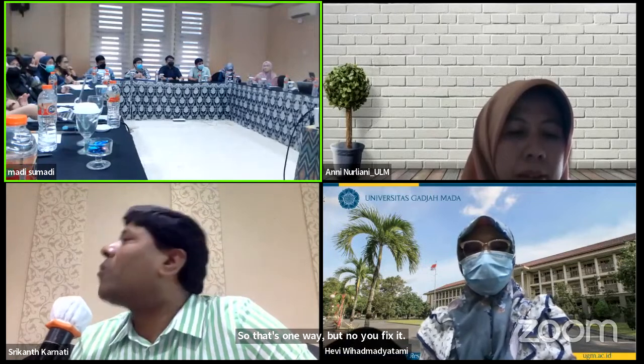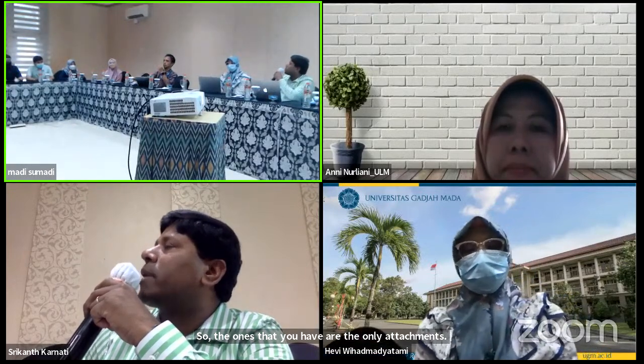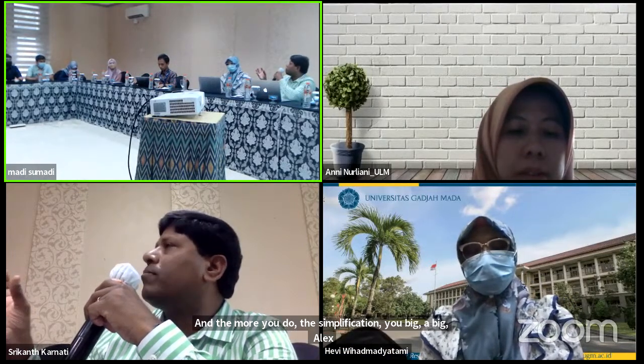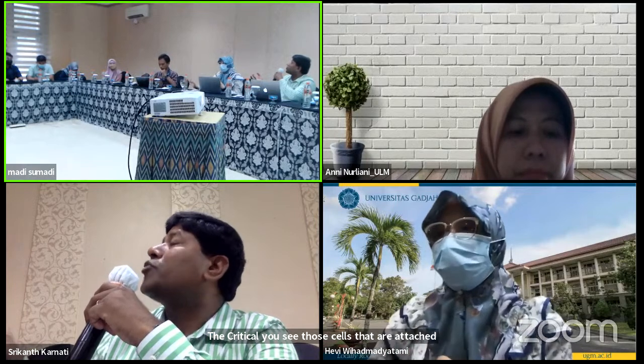Thank you. I think what you said is absolutely true. When the cells die, they won't attach. But you fix everything, whether the cells are dead or not. And before that, you need to do centrifugation, right? When you do the centrifugation, the dead cells are already gone. So the ones that you have are only the attached ones. The more you do the centrifugation, because you do it from the cell culture, the more you pick a big collection of tissue, like an organoid, a very big structure, and you remove all the supernatant. Then theoretically, you see those cells that are attached. So they should be all healthy ones.